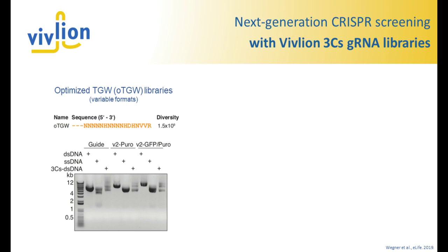and this is shown here. So what we basically do is we deleted the first 3 nucleotides, and thereby not so much affecting the 20 million target sites in the human genome, but dramatically reducing the diversity of this reagent, and now making it very feasible to actually screen these reagents in suspension or even in adherent cells.